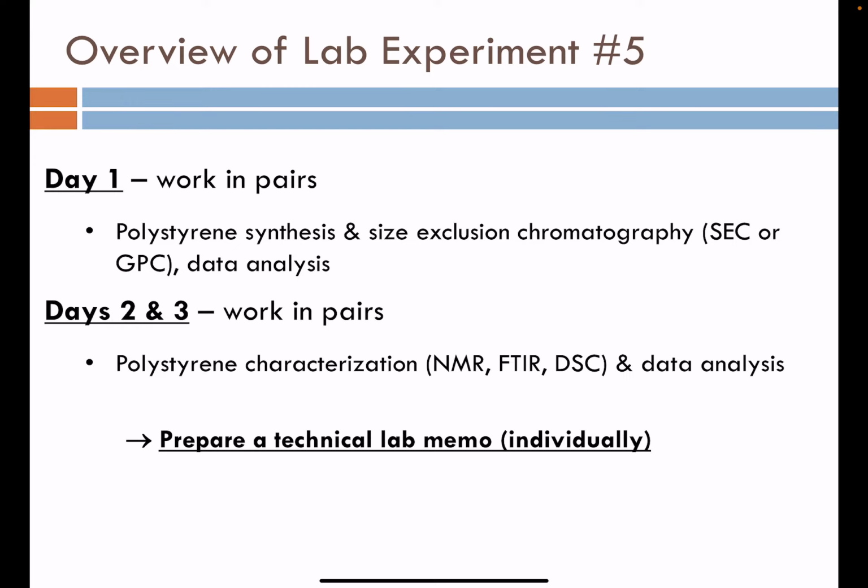So typically in day one, students would work in pairs on the synthesis and prepare GPC samples or size exclusion chromatography samples. Day two is where students would again work in pairs and acquire NMR, FTIR, and DSC data and begin their data analysis and interpretation. For this lab in the Spring 21 session, we're going to have students prepare a technical lab memo as an individual assignment.